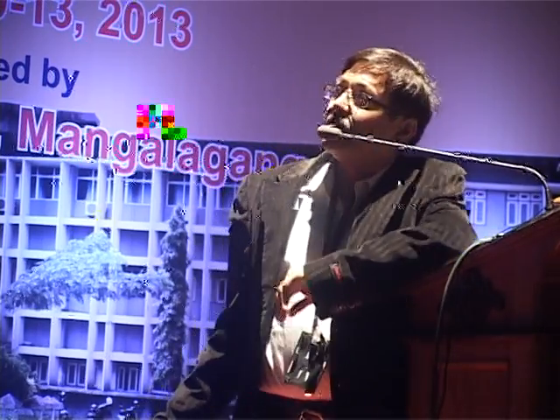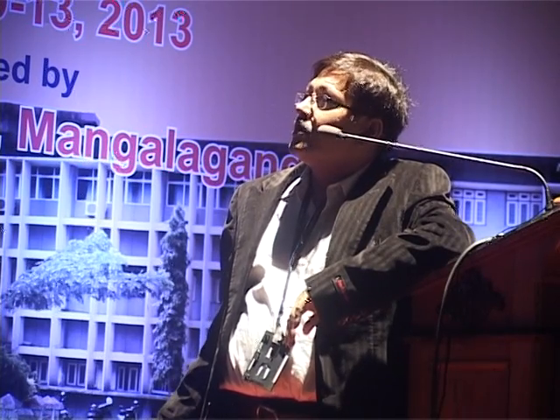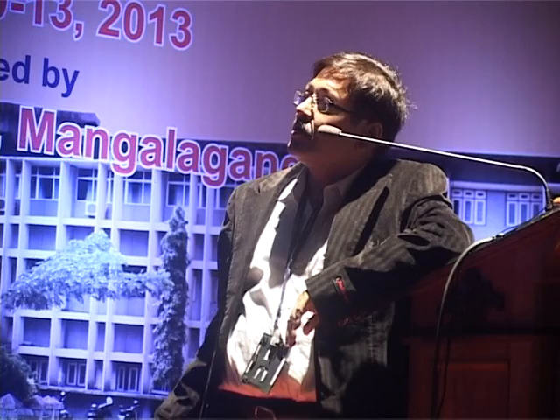Again, you can see here the water which is collected, and this is one of the soil collections. These are the survey meters we typically use for radiation mapping of the area, and this is where the water samples have been analyzed for the parameters.